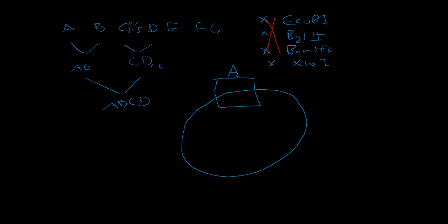If you have a part that you need, but it has some of these restriction sites in it, then you need to use a technique like sewing PCR in order to remove them. For reference, you can check out the sewing tutorial to figure out how to do that. We're going to assume that you've already removed all of the restriction sites from this part. The reason we can't have any of these restriction sites in this part is because these restriction sites are going to be very important for our assembly.